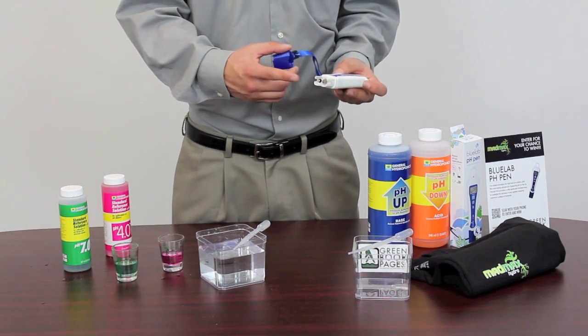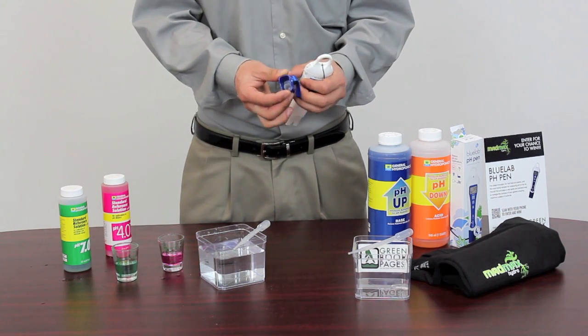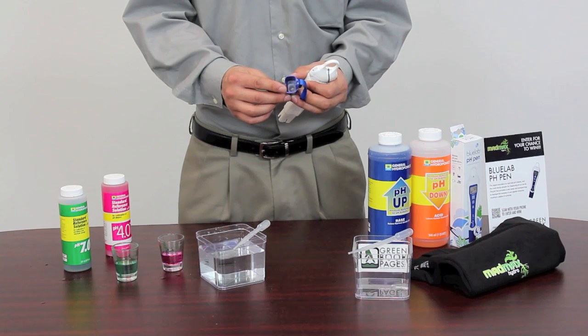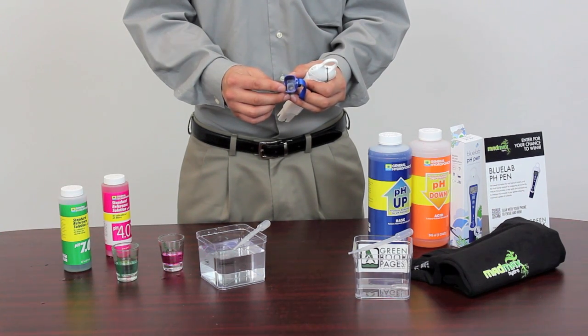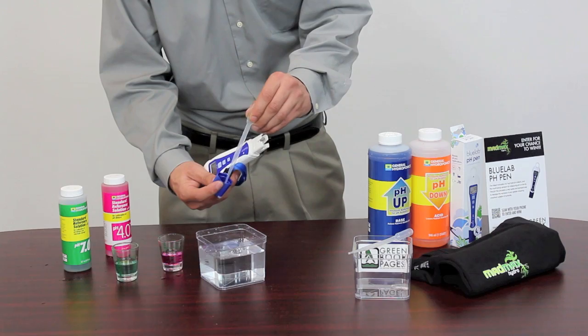When done using it, to store your device you need to ensure that your sensor stays wet at all times. Blue Labs has developed a sponge-like feature inside the cap of the pen just for that purpose.